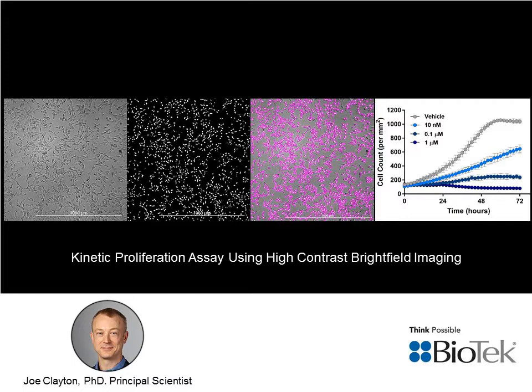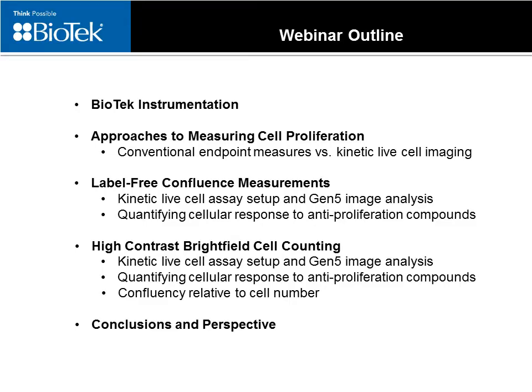And throughout this presentation, I'll highlight how this imaging-based approach enables detailed qualitative assessment of cell proliferation as well as changes in cell morphology over time. The content of this webinar is outlined here.